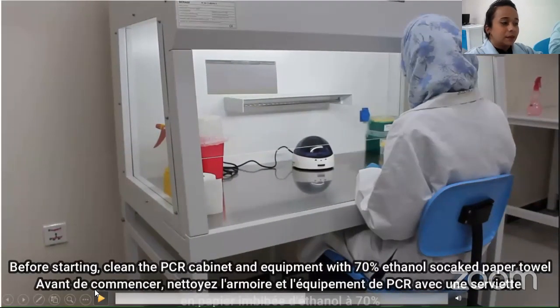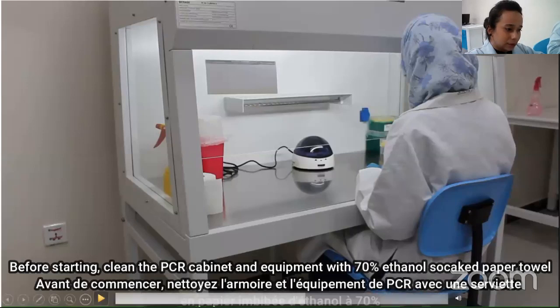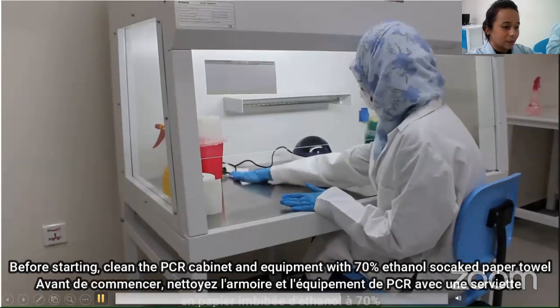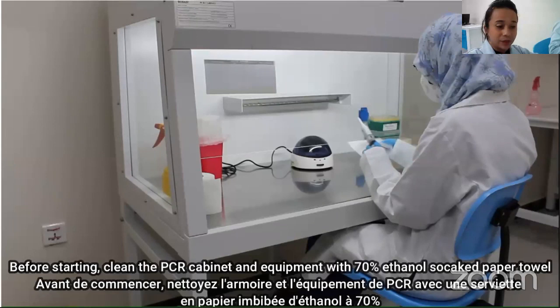Before starting, clean the PCR cabinet with 70% ethanol. Also clean all the mini equipment that will be used during the process, and close the sash of the PCR cabinet. So here we are cleaning it with 70% ethanol.